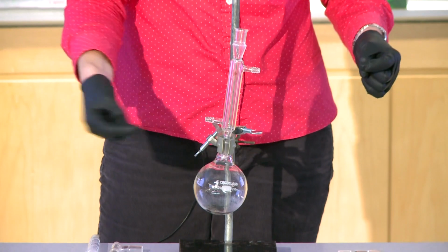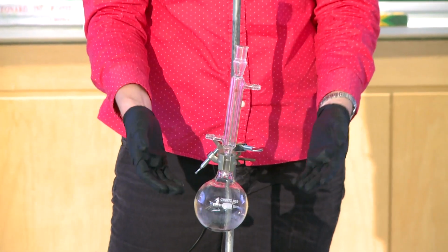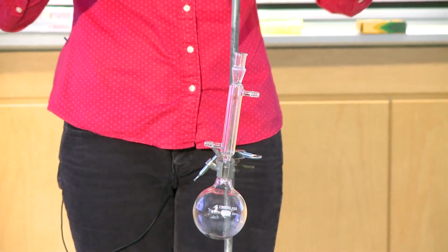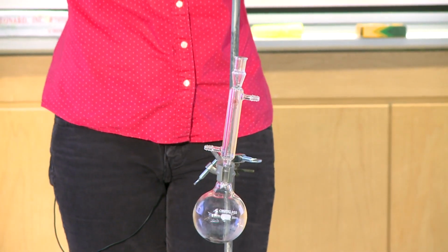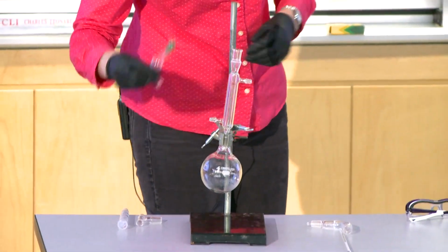You'll want your water going in the bottom and out the top so that the whole thing fills up with cold water. So when you're boiling, your solvent will be evaporating, and then it'll condense and go back down so that you don't boil to dryness and you don't lose all of your product as you're boiling it. And then on the top, you're going to put a drying tube.